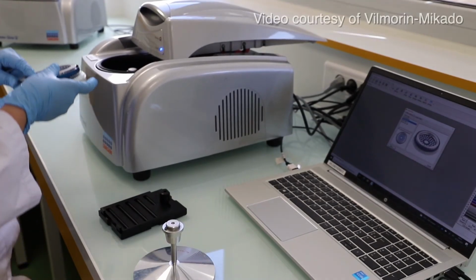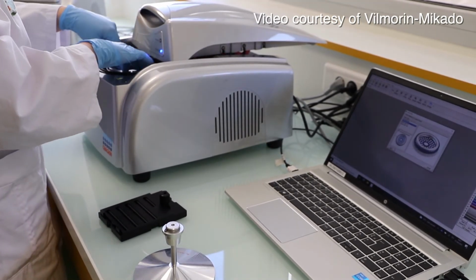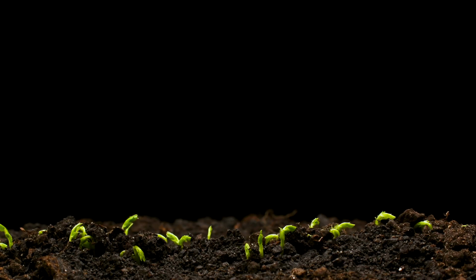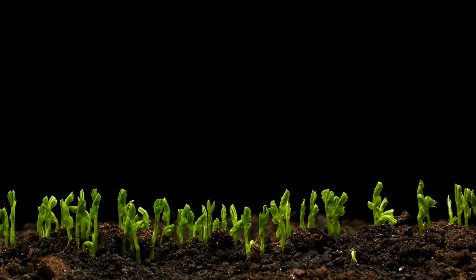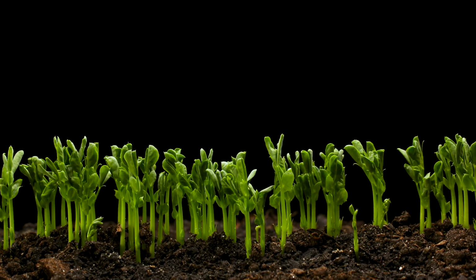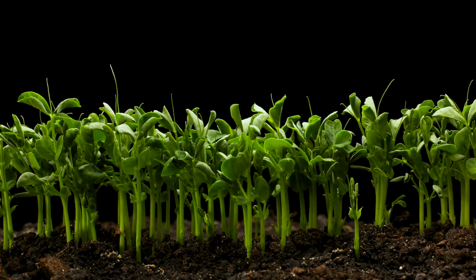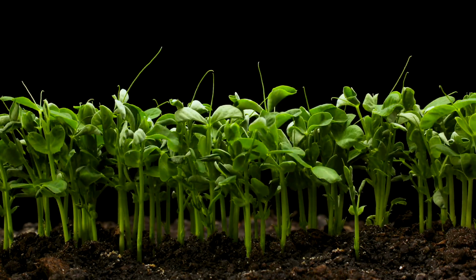So for me, the involvement, the motivation of people was the key of success. And also the guidelines provided by ISHI on method validation were a good framework, and it was very helpful to achieve this project. Together, the project team confirmed that the PCR test meets the purpose and criteria for identifying suspect PSP isolates. This gives scientists everywhere an effective tool to prevent the spread of a disease where seed is a pathway.